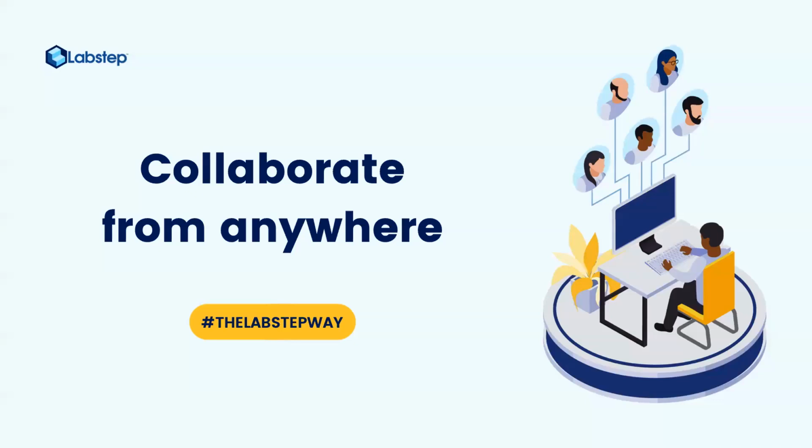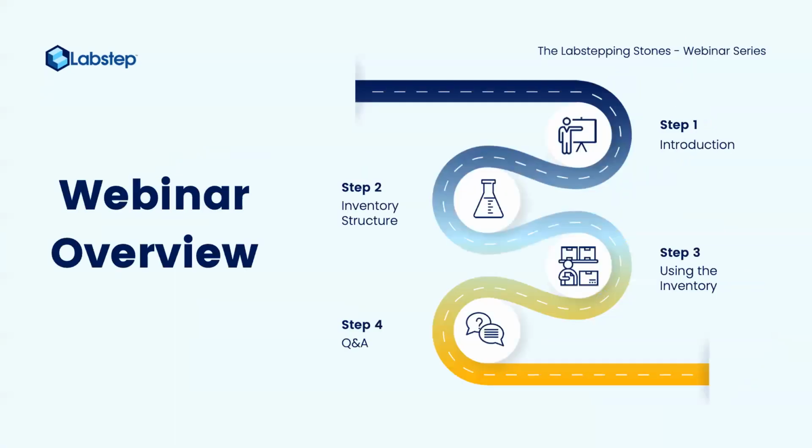I'm in charge of writing articles in our help center, the customer support, and our webinar series. So today I will walk you through how to get started with the inventory module. You'll learn the difference between resource categories, resources, and items, but also how to use resource and item templates.